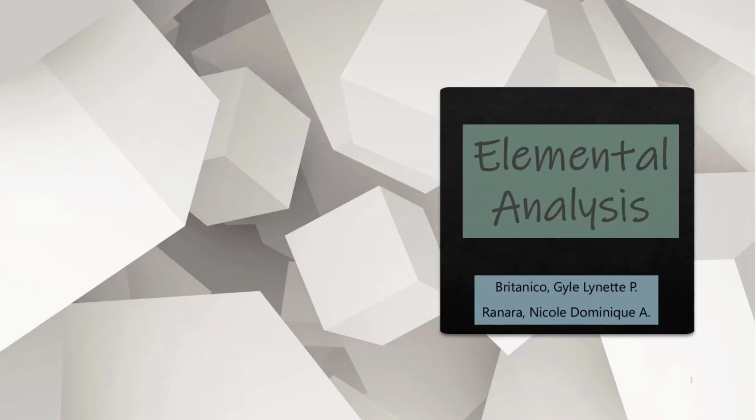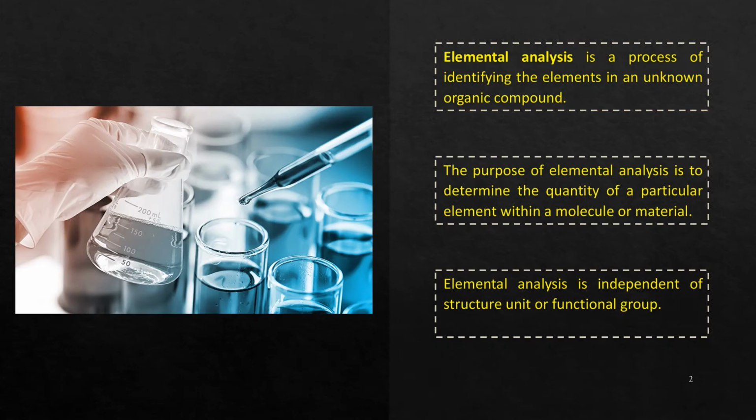We are RANARA in BRITANICO and we're going to report about elemental analysis. Elemental analysis is a process of identifying the elements in an unknown organic compound. The purpose of elemental analysis is to determine the quantity of a particular element within a molecule or a material. Elemental analysis is independent of the structure, unit, or functional group.